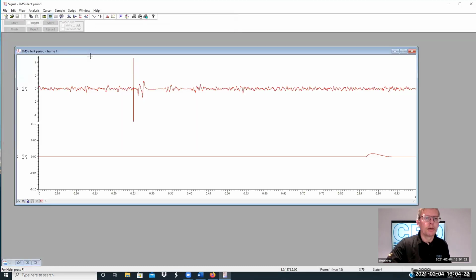So a data file, a sweep of data. In this case, we have 0 far to the left of the true stimulus time. So that's perhaps incorrect. And we've recently developed a script command to now offset that 0 position to this new corrected time. And we can look at that a little later if anybody needs it.